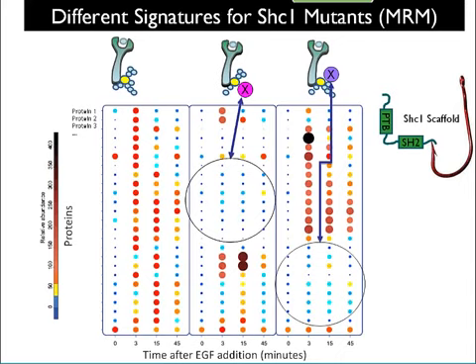And this, again, as with the kinase story, shows us that we can assay for terrifically large amounts of information about mechanistic effector molecules in a cancer state and try and tease out what's actually happening. So these sorts of assays are of terrific importance to drug makers because they can try all sorts of things on cancer cells and then look at not just if the cell dies or doesn't die or gets big or small, but they can look at the underlying molecular information from a mechanistic sense.